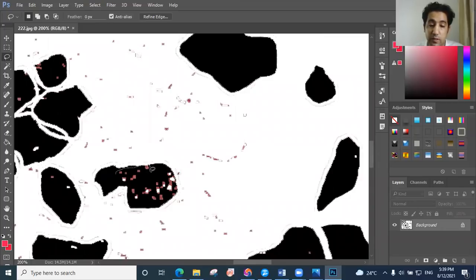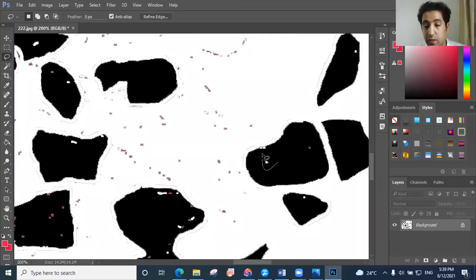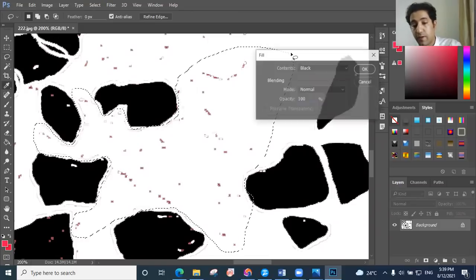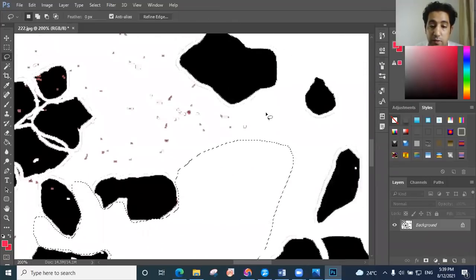If you don't do this, it's okay. The app will not count them as grains, just to make sure everything is okay. Just cover these dots to be black. And the only thing we need is to clear and clean these black dots on the microstructure. The bigger you can make and control, the faster you can clear the surface.